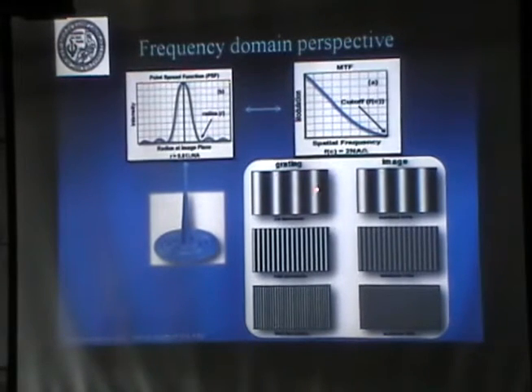And so this is what this means. This is called the modulation transfer function. If you are looking at the grating, this is low frequency. You are around here. That means that your response is good, so you're going to essentially see the same grating. Now, if you have a higher frequency, you are down here. The contrast is going to be reduced, and so if you look at this, you see lower contrast. And if you look at very high frequencies, like this, you might lose the contrast altogether. So that's the meaning of the modulation transfer function.